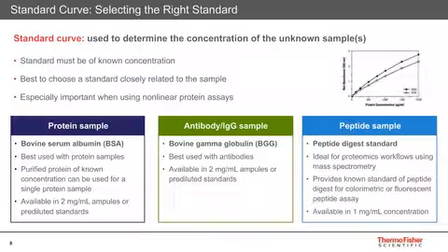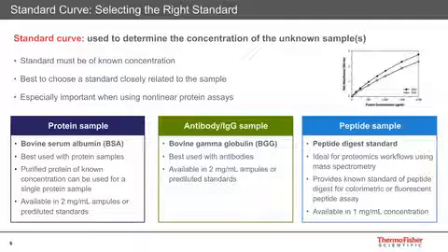The second method is the dye-based reaction, in which proteins bind to dye in acidic conditions, due to which the dye solution changes color. In this example shown here, a blue color is formed, which has an absorbance at 595 nanometers.